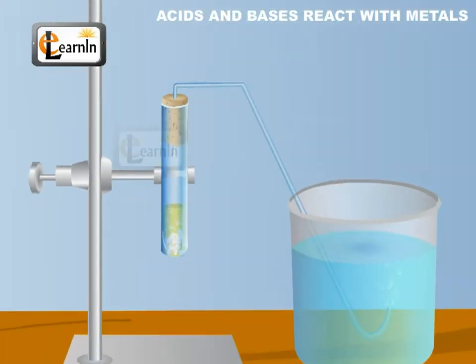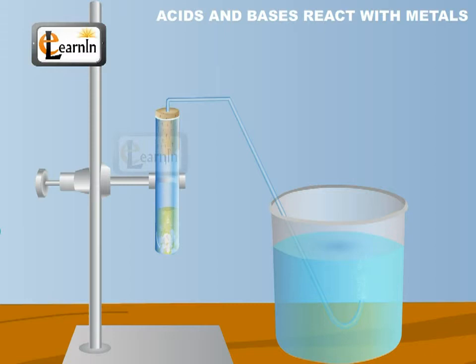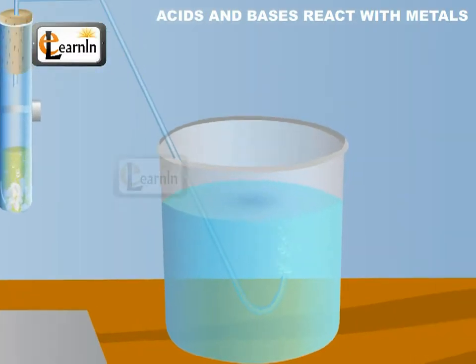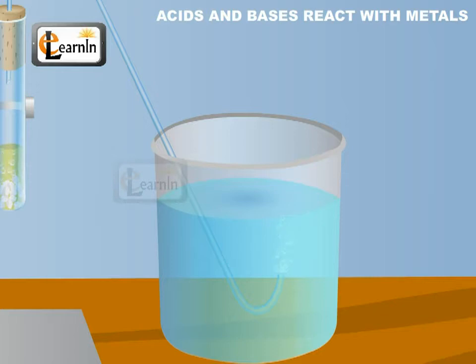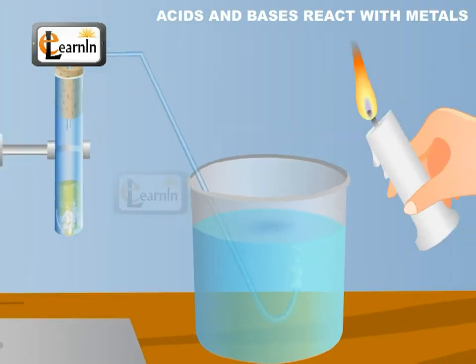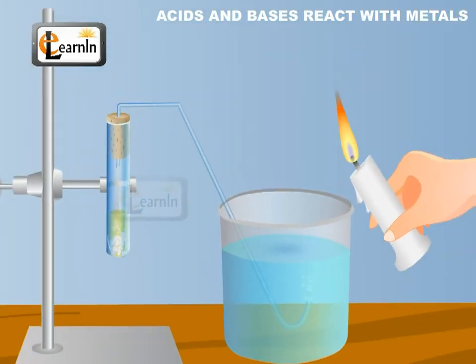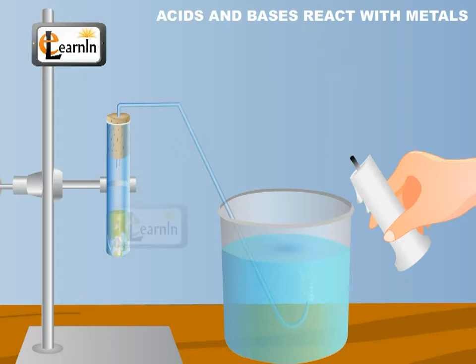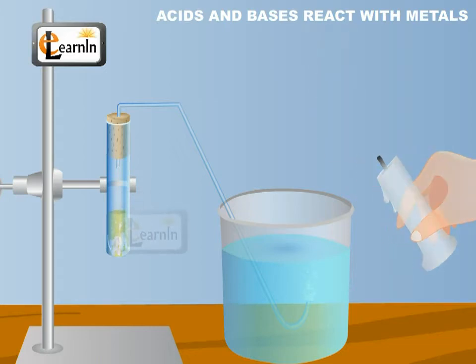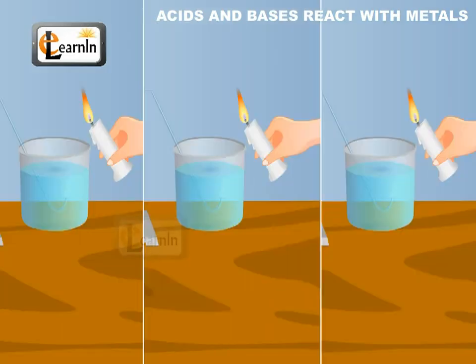Pass the gas to the soap solution. You will observe bubbles forming in the soap solution. Now take a burning candle near the gas. You will observe that the gas burns with a pop sound.